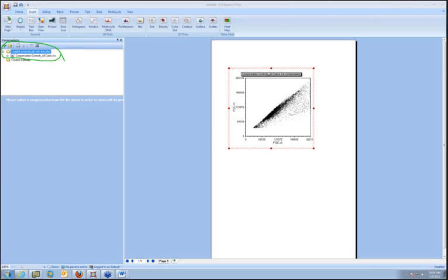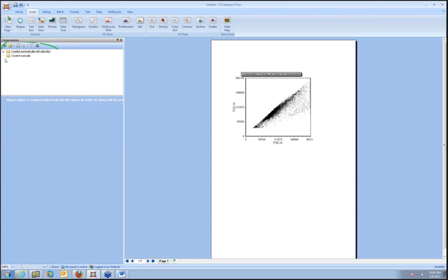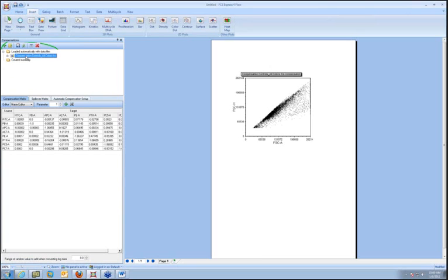And you can see here that when I delete the last plot that's using the data file, the compensation went away. That compensation is no longer active. So those compensations are linked to the data and they load and unload themselves automatically as you load and unload data. Now, if you were to drag the compensation from the loaded automatically section to the created manually section, that means that compensation matrix is now unlinked from the data and will stay open all the time.